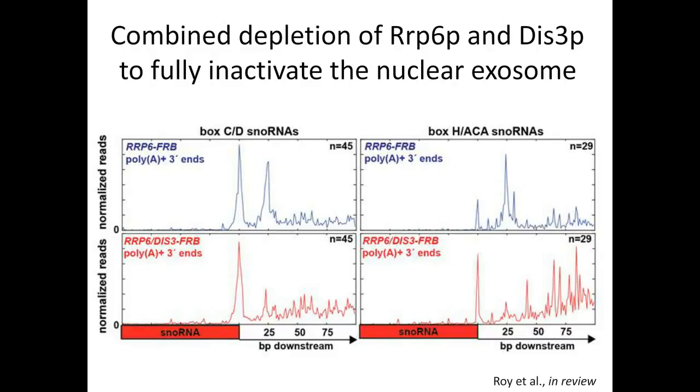So we first looked at the combined depletion of both of these subunits of the nuclear exosome, and what we noticed was this 25 base pair peak downstream of the snoRNAs. In the Rrp6 depletion alone, we can see that the peak is predominant along with the peak at the mature 3' end. When we remove both subunits of the nuclear exosome, we can see that the plus 25 base pair peak is substantially reduced. This led us to believe that we were effectively inactivating the nuclear exosome.